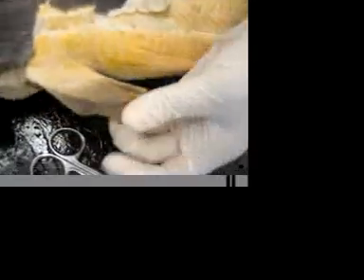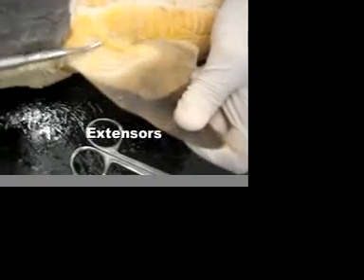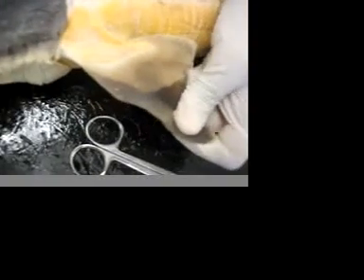Looking on the pin, we have extensors on the dorsal surface.